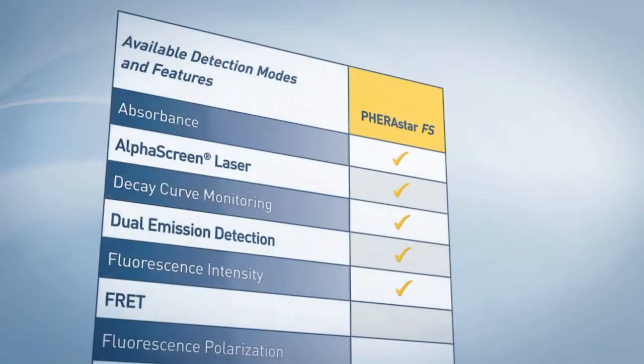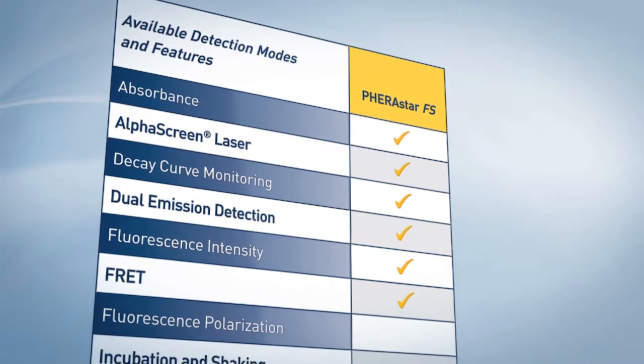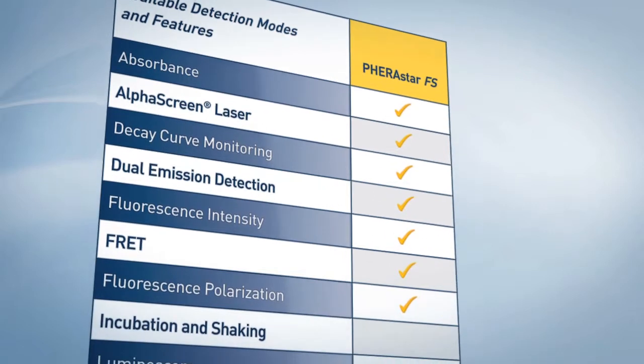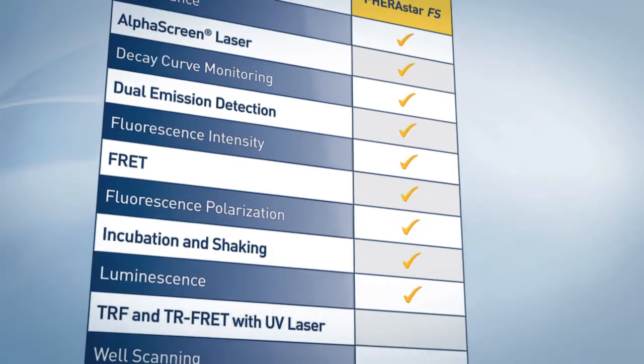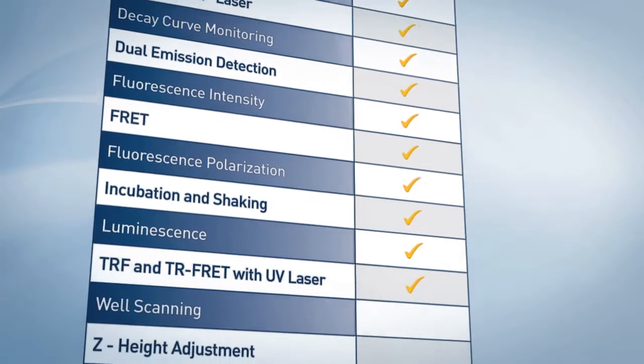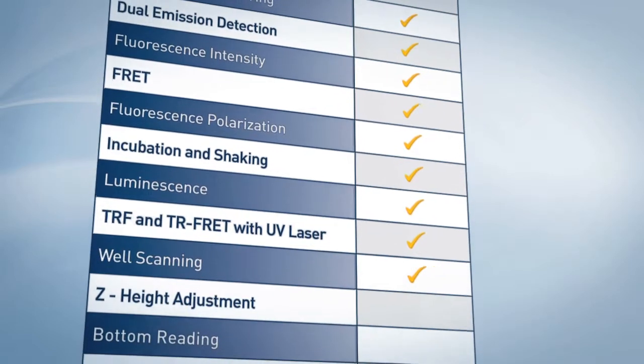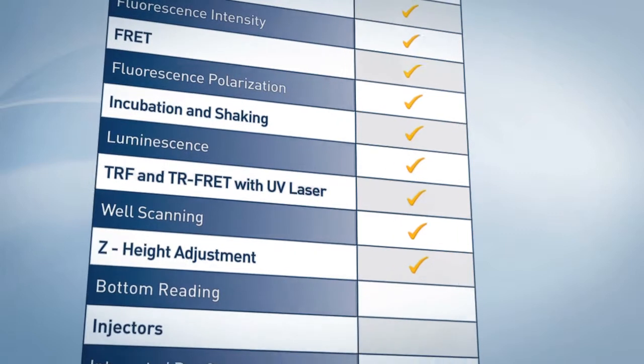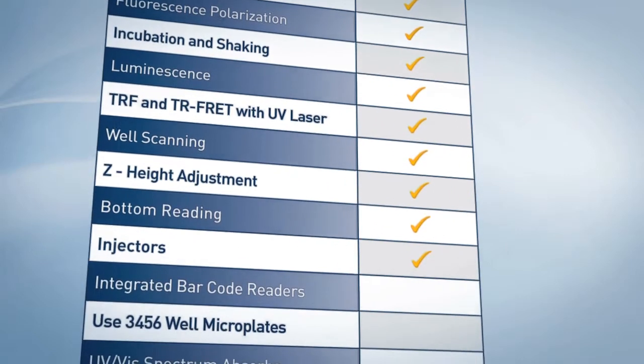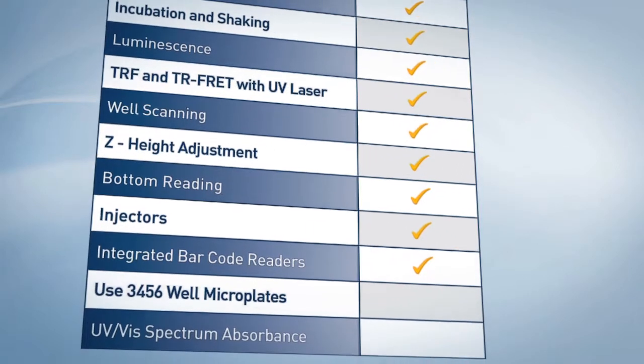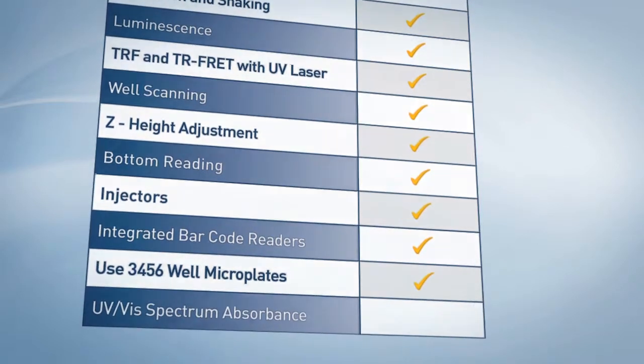When a lab requires speed, the Ferristar FS is the fastest reader available. If a method demands sensitivity or detection of low volumes, no other microplate reader performs better. The Ferristar FS sets the performance bar for advanced detection methods like TR FRET, alpha screen, and cell-based assays with no compromises for other detection modes.